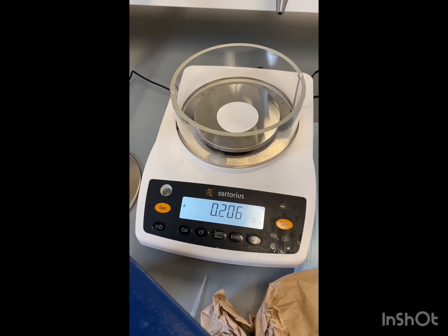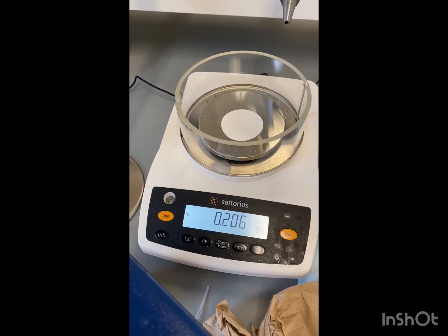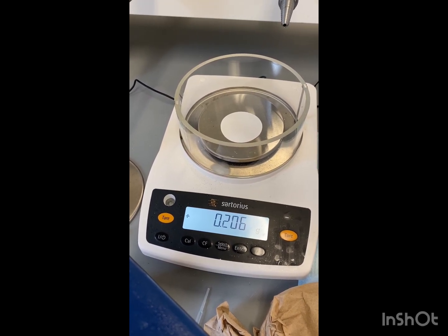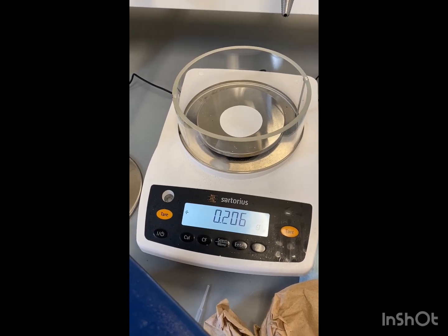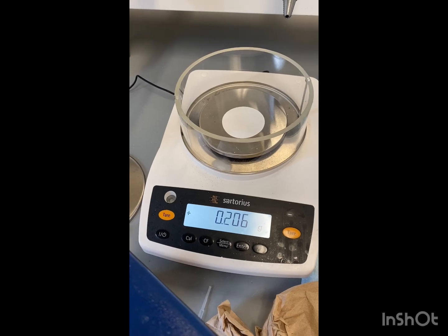I went ahead and weighed our filter paper in the Buchner funnel. That way, when it's completely dry, we can just take the paper out, put it on the scale, and subtract this number from our final mass to get the actual mass of our product.